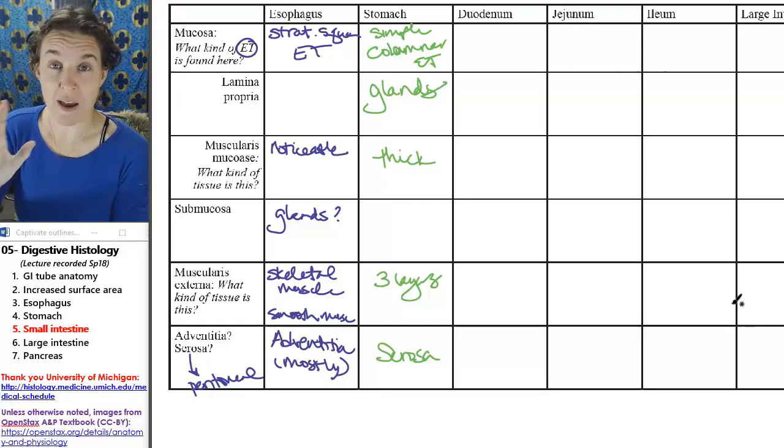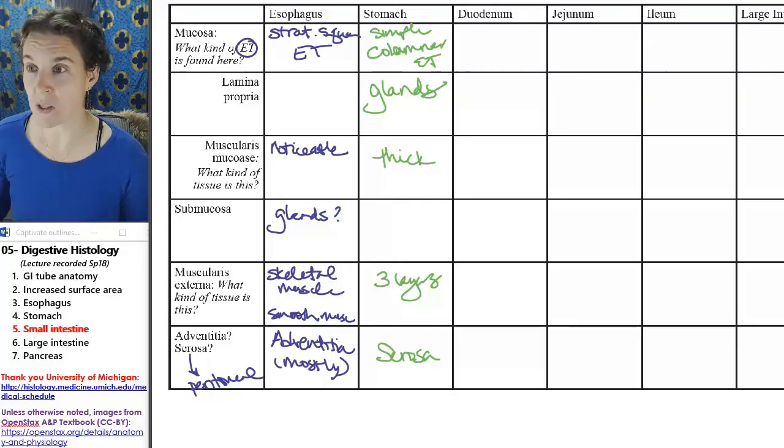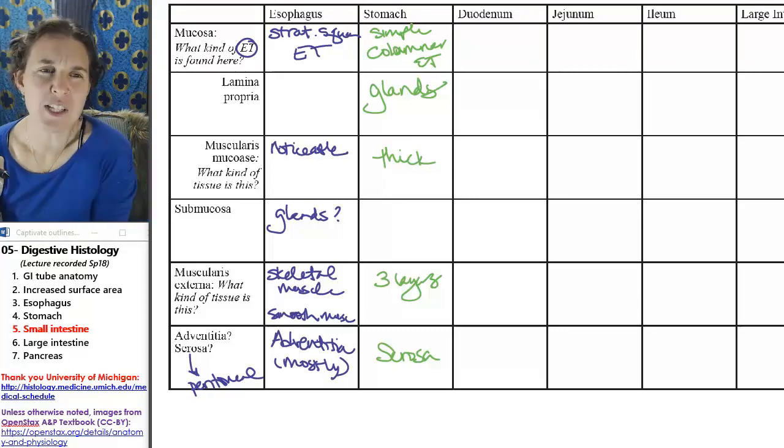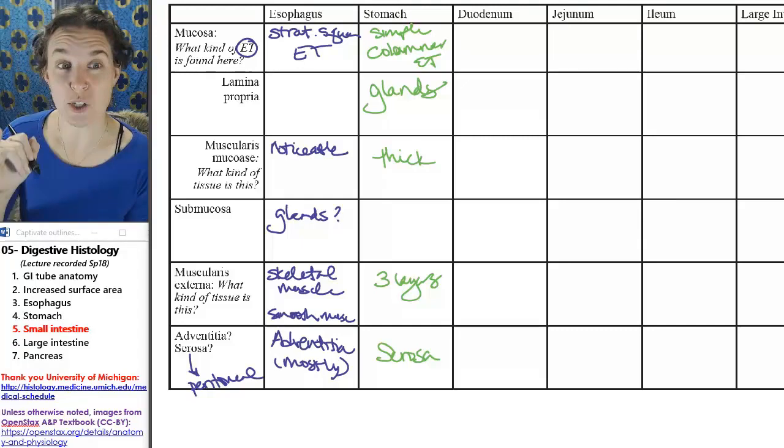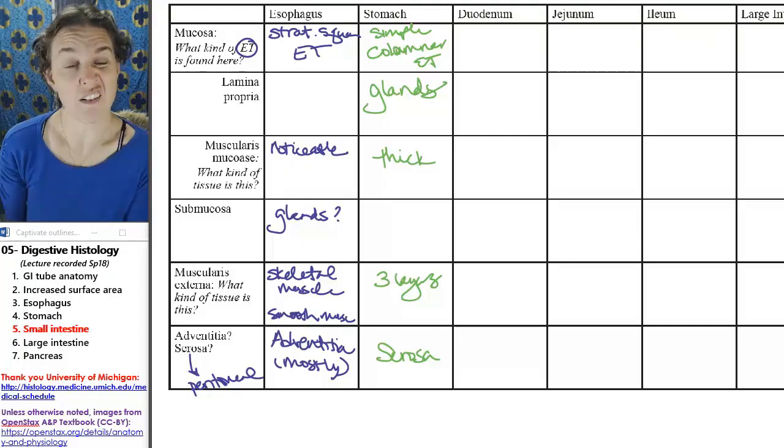Small intestine. We have three parts of our small intestine, and I'm going to show you the distinguishing characteristics of them.